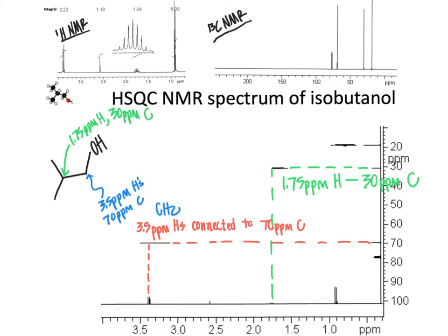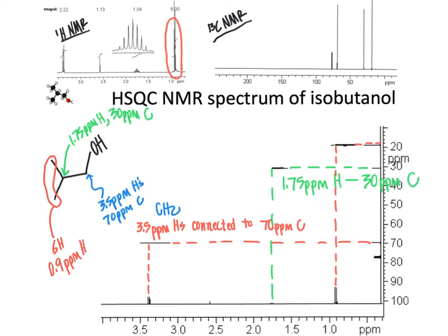Looking at the doublet at about 0.9 ppm, following that up and over to the y-axis, that signal is at about 20 ppm. In the proton spectrum, the 0.9 ppm signal integrated to six, which corresponds to the two methyl groups in isobutanol. So the proton signal at 0.9 ppm represents those six equivalent methyl protons, and the carbon directly bonded to them is at about 20 ppm.